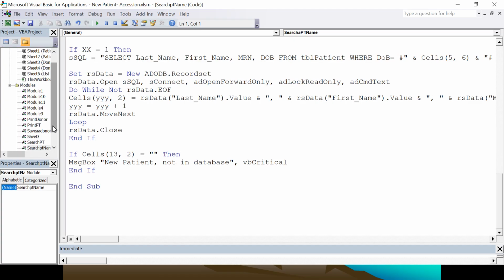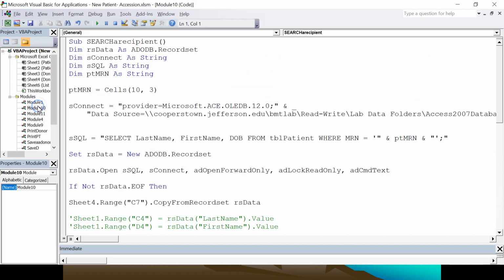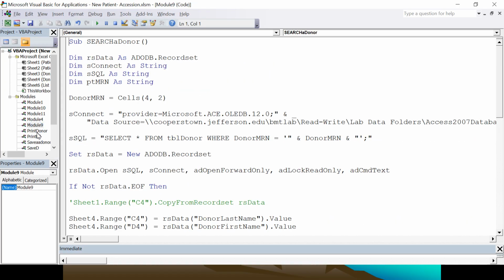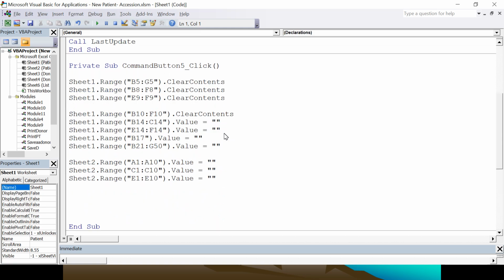And there's another one, which is clear all. I think, no. Oh, it's not here. Maybe clear all. Yeah, okay. So you can make a module, or you directly put it under this sub button. You don't have to make a module. So this is the 5.